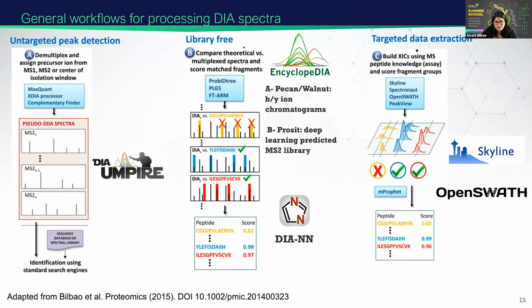And this type of analysis also uses a scoring scheme where you can compare the fragmentation pattern, basically the abundances of the fragments in the DIA spectra, against the library to increase the confidence of the identification. And the widely used algorithm for the false discovery rate analysis in DIA data is called mProphet, which basically calculates a score that combines several features.